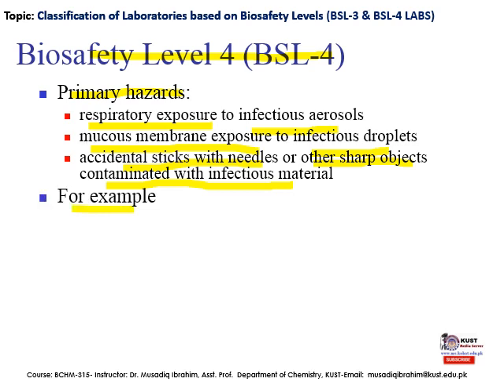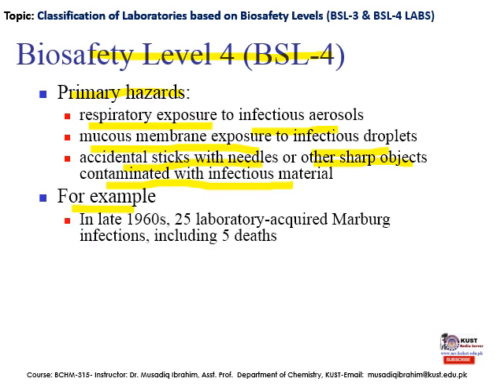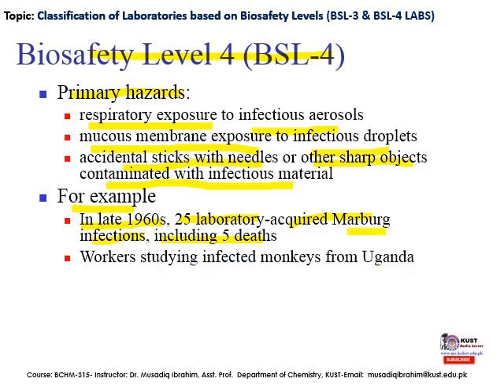The examples which have been reported in the BSL-4 level labs are from the late 1960s, when 25 laboratory workers acquired Marburg infections, including 5 deaths, because they were dealing with the Marburg virus. Workers were studying infected monkeys from Uganda, and then ultimately some of them died.